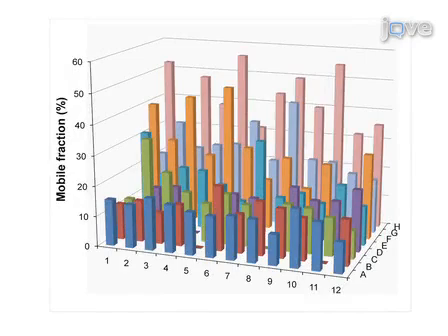Engineered beta-2 adrenergic receptor was labeled with Cy3 NHS ester and used in LCP FRAP precrystallization assays in automatic high throughput mode, in which each sample of a 96-well plate is bleached sequentially and fluorescence recovery is measured after a 30-minute incubation. The obtained fluorescence recoveries, which represent the mobile fraction in each sample, are plotted for all 96 samples. The screening solutions contain 0.1 molar tris pH 8, 30% volume by volume PEG 400 combined with 48 different salts at 2 different concentrations.